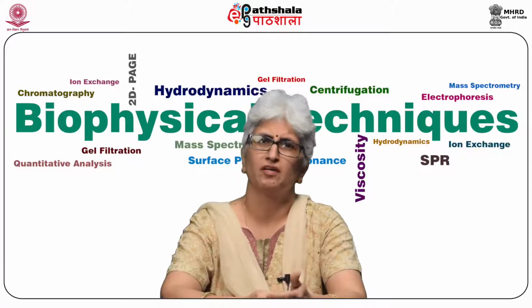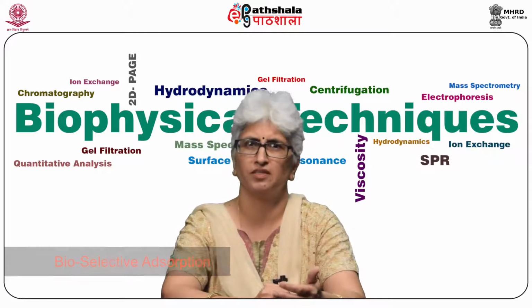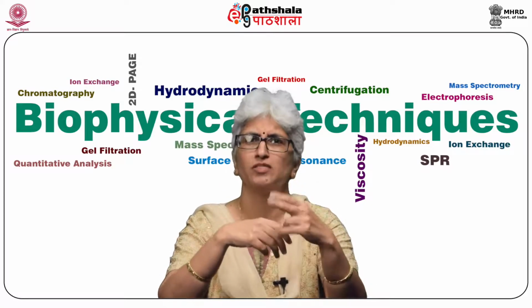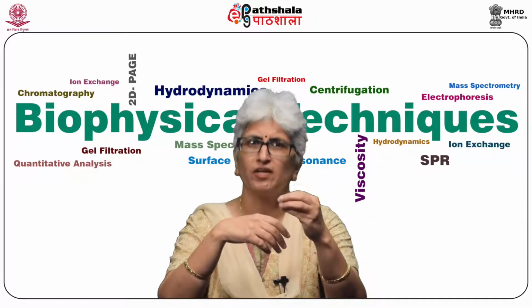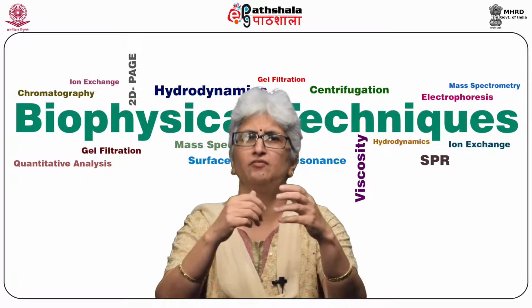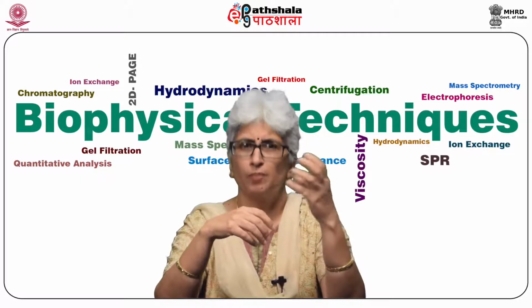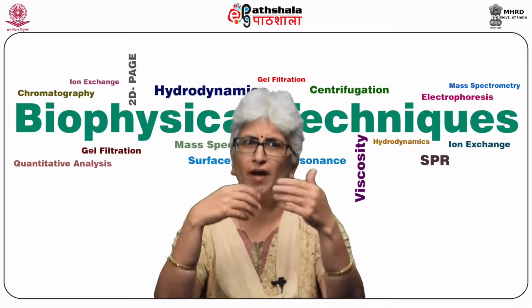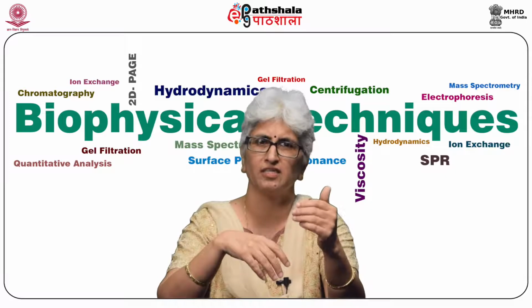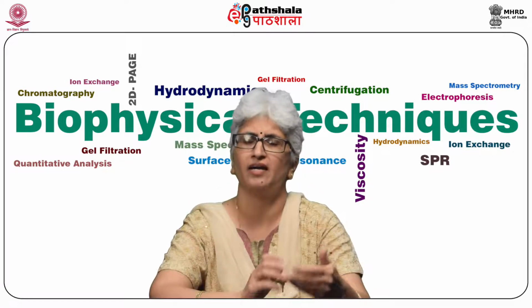Now, what is affinity chromatography? Affinity chromatography is also known as bioselective adsorption. This technique uses specific binding affinity between two molecules. In this technique, a specific ligand is immobilized to an inert support matrix in such a way that when sample is passed through it, the molecules which have specific affinity to the ligand will bind to it.